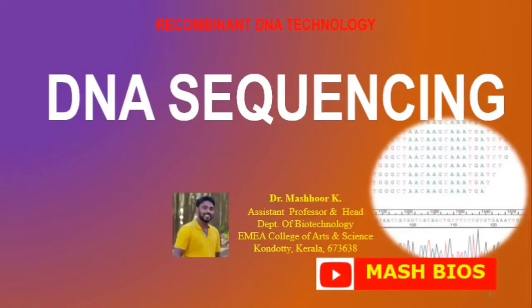Today we can discuss DNA sequencing. In this class, we'll discuss the basic steps and basic methods involved in DNA sequencing, and the modern techniques which are used in DNA sequencing.